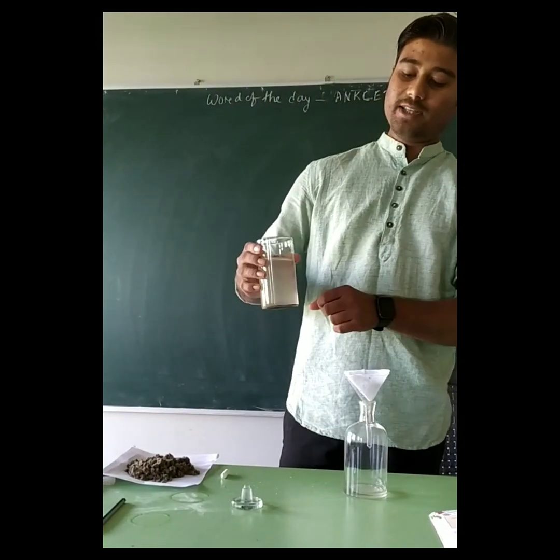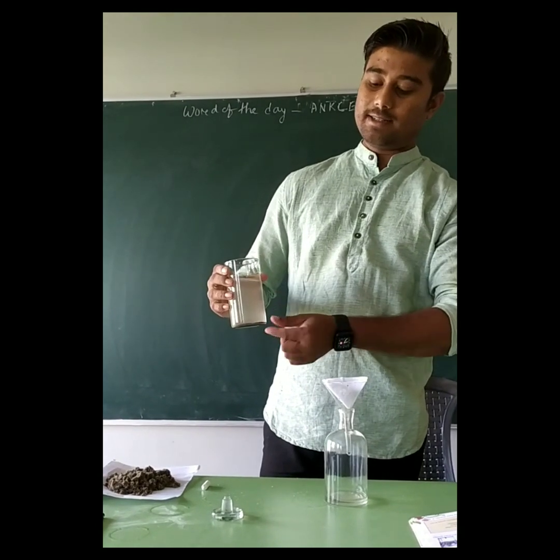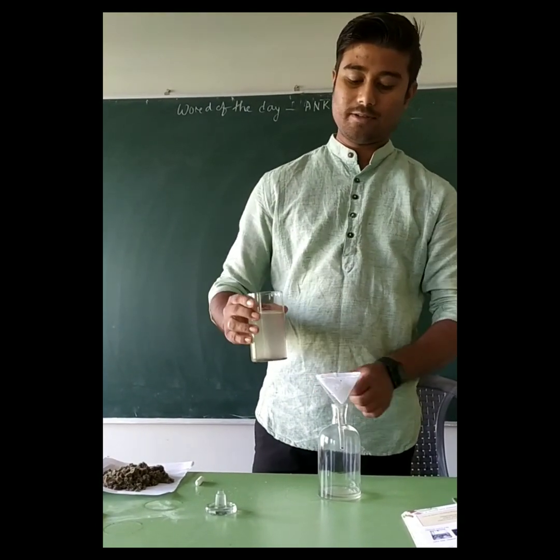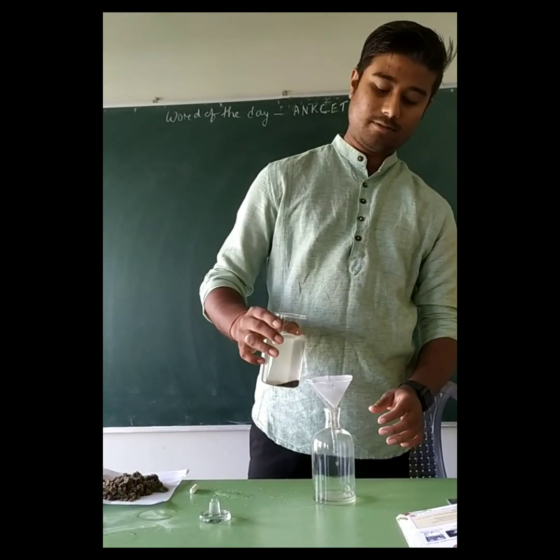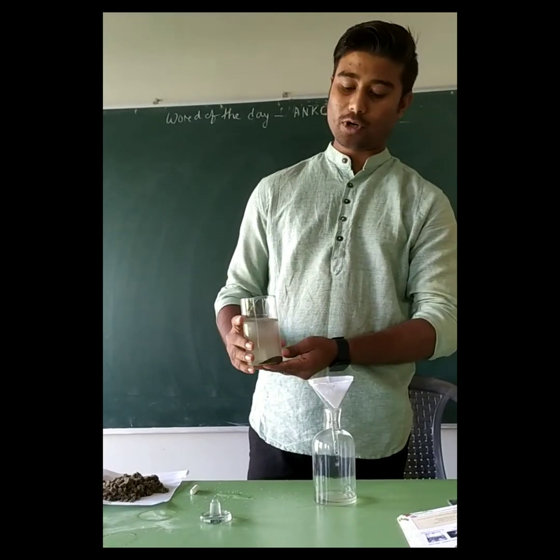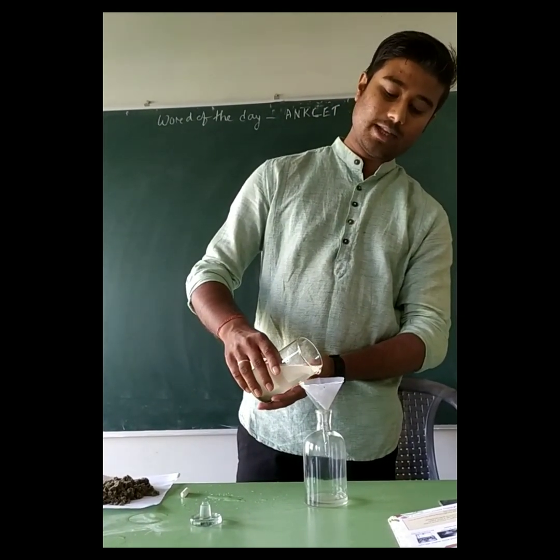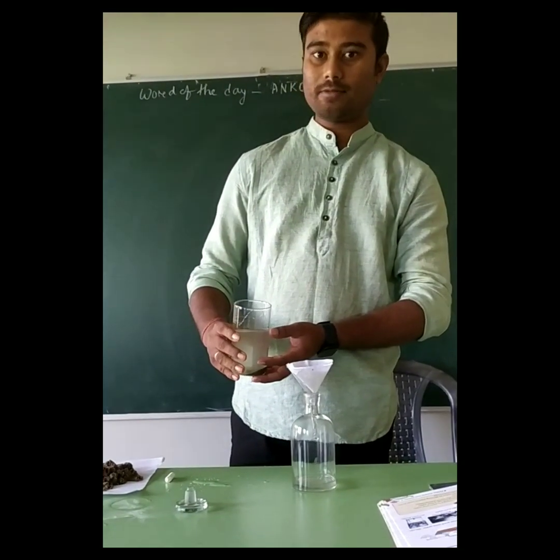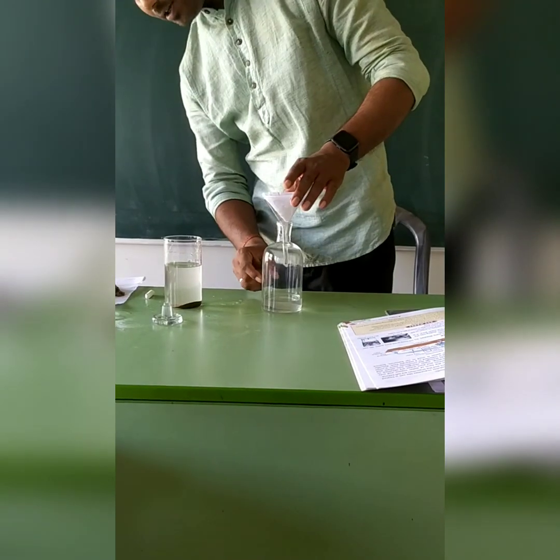And we separate this water and sand. We will separate this water and sand. Slowly, slowly we will pour it, so that the sand doesn't get disturbed.